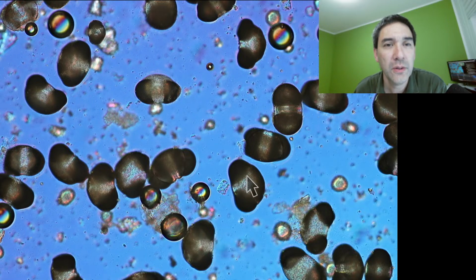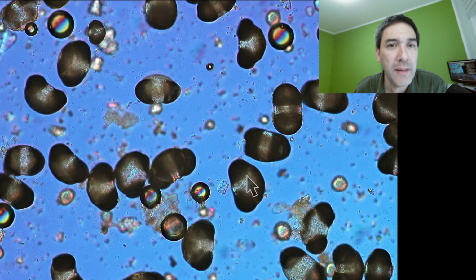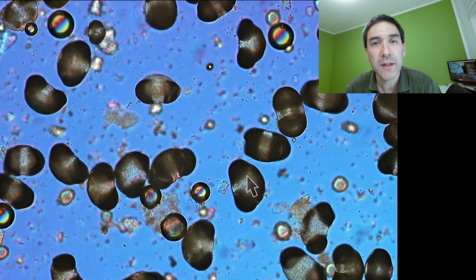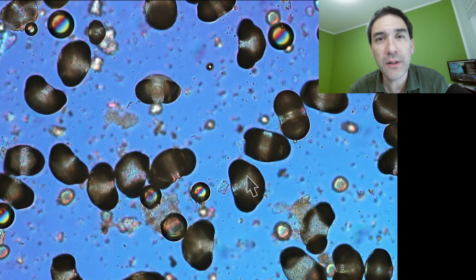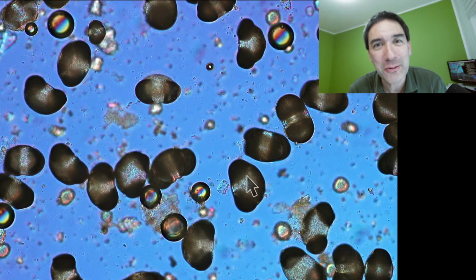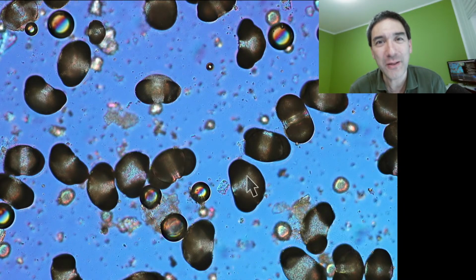Have you looked at the micrometeorites suggested by another participant? Yes, I have. However, this is another thing here. You cannot be absolutely sure that these are micrometeorites. You'd have to do some additional testing.